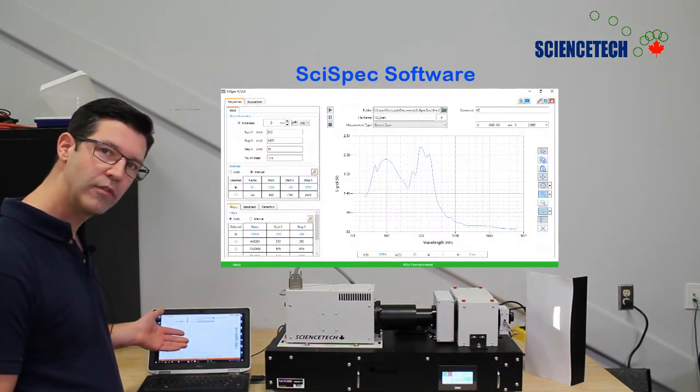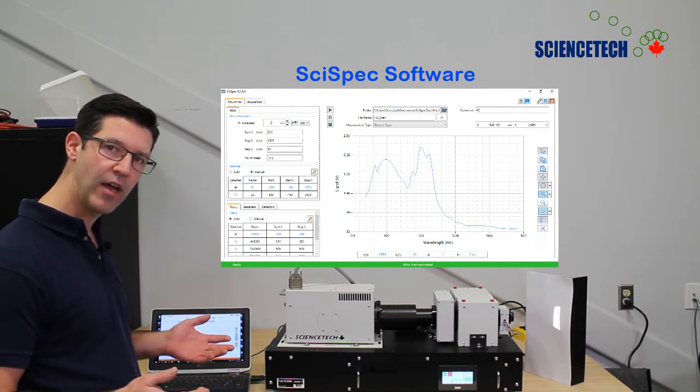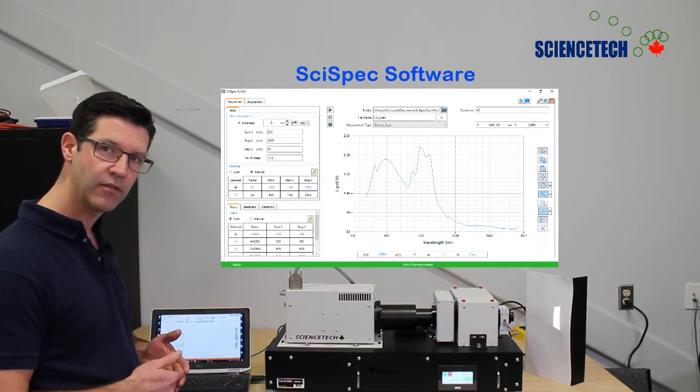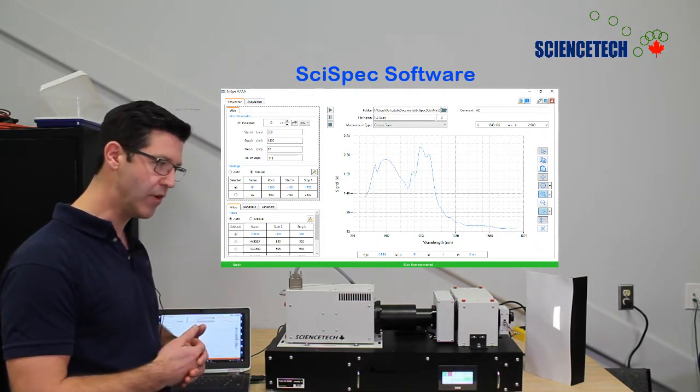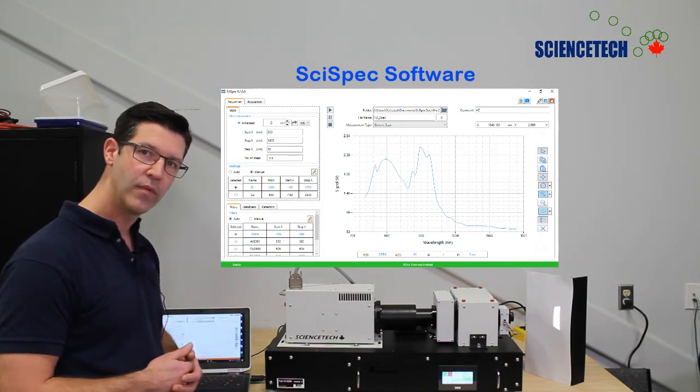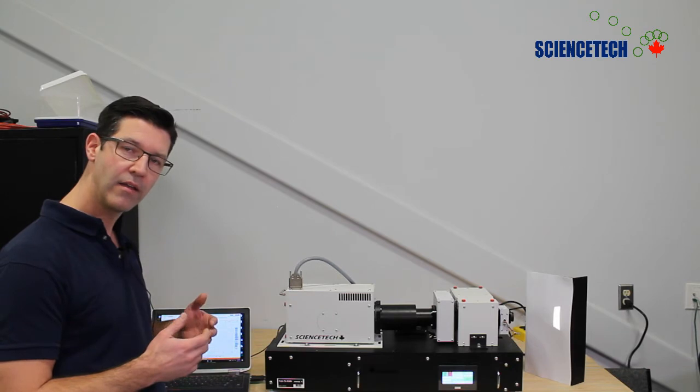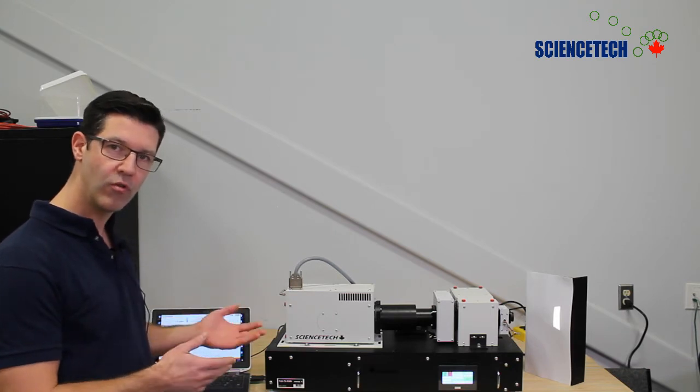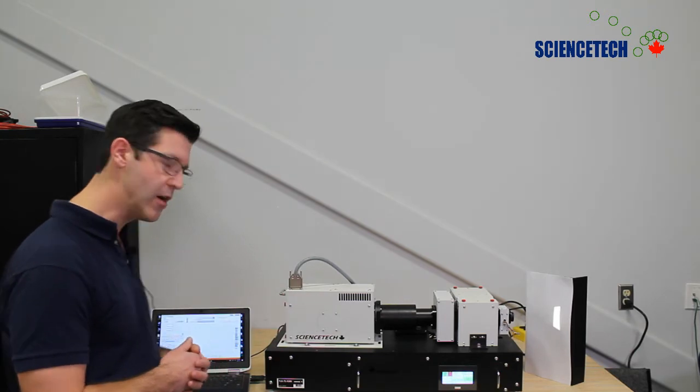The software that we use is called SciSpec. It's completely made at Science Tech by our own software engineers. Using this software we can control different operations of the light source as well as the monochromator and the filter wheel. We can also integrate further controls through a remote access system. We also have LabVIEW drivers that are available for this kind of system as well.